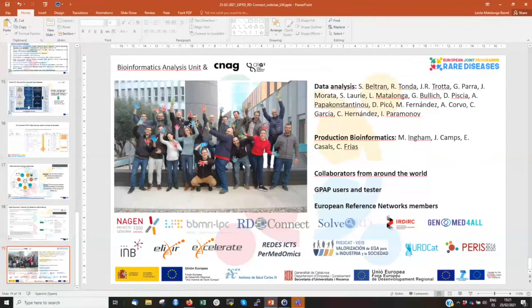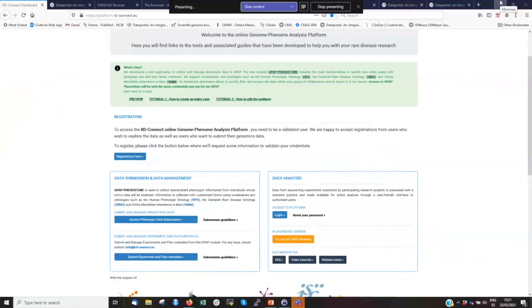We had two on the chat that we answered regarding the need to transfer data between CPMS and the GPAP. As I said in the chat, we use Phenopackets for both input and output, among other formats. But I don't remember now if CPMS is already compatible with Phenopackets or not. But we can take other questions.